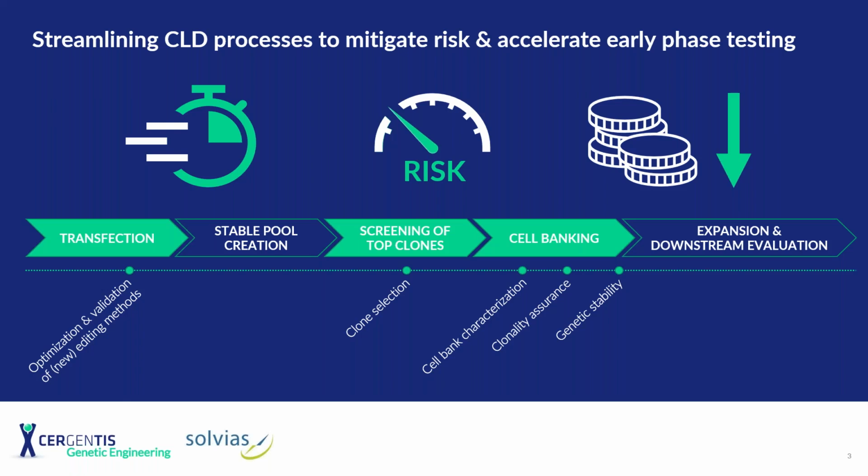In this webinar, we will go over the different stages of a cell line development process and where proper genetic QC steps could be implemented. At each of these critical steps, we will go over some of the key challenges and considerations. We will also provide the best genetic QC practices, and we will define the role of our TLA-based QC.